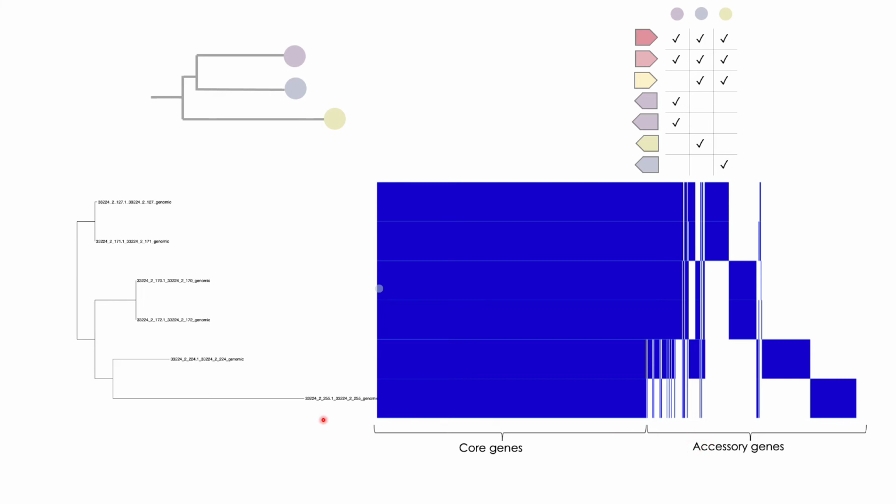And again, I should also mention that these are 6 Yemeni Vibrio cholerae genomes. So again, I am actually using a relevant example. And this is the start. This is one pretty picture that we can make. So we finally got there.